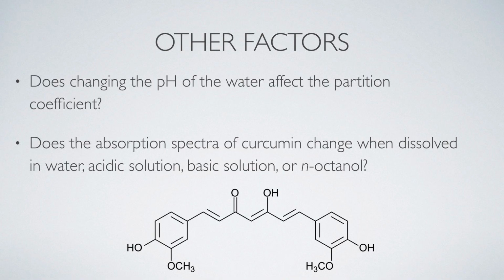Now, to take this a little bit further, this might also affect the absorption spectra. We can't take for granted that just because its maximum wavelength of absorption in octanol is one wavelength, it will be the same in water. And so we can look at how these things are affected and just take that experiment that little bit further and allow your curiosity to take free rein. Hope this introduces the experiment for you, but you can ask me questions in the lab if it doesn't.